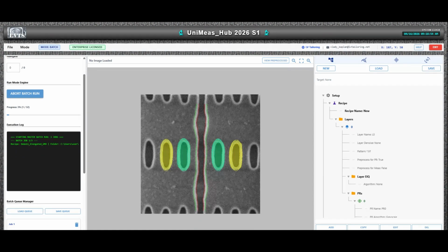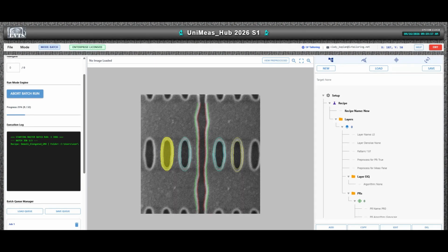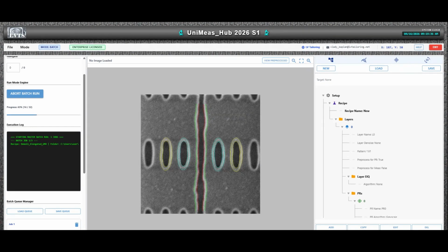During the pattern recognition phase, the engine searches for target features and applies precise measurement logic to all located features. It dynamically adapts its measurement boundaries to the slight physical variations present in each new image.